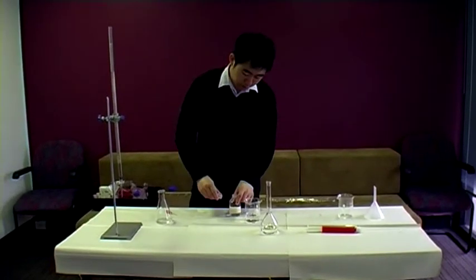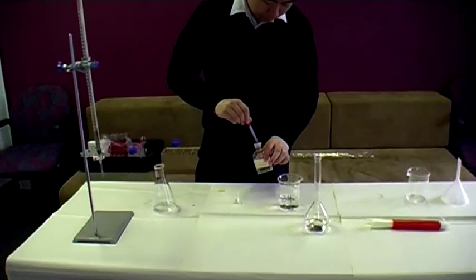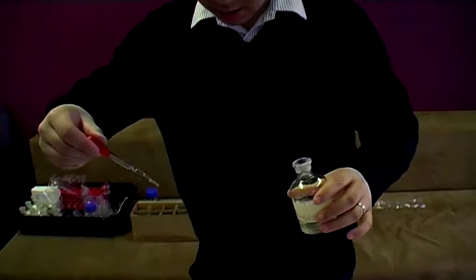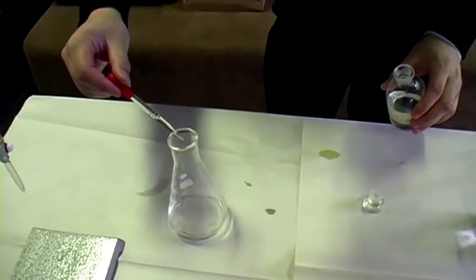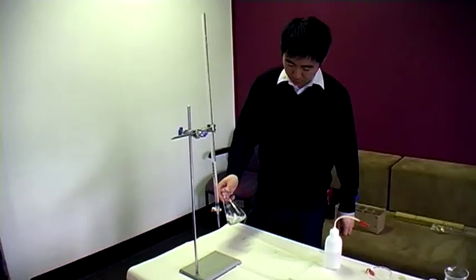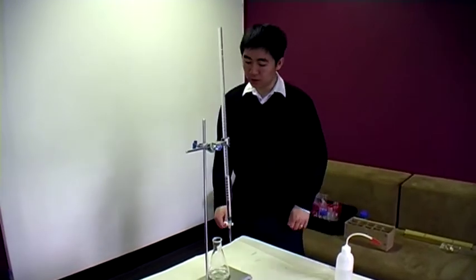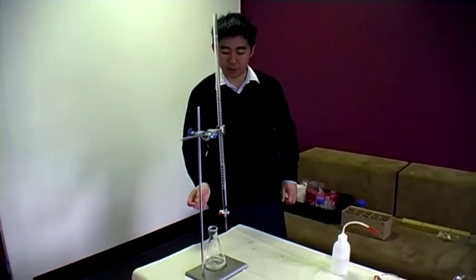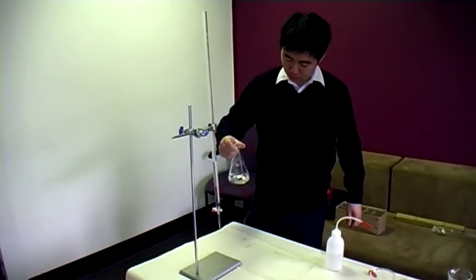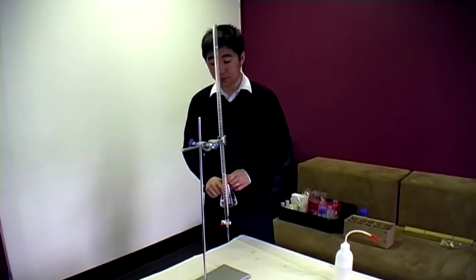We add two or three drops of phenolphthalein because our conjugate salt at the equivalence point is slightly basic, so we choose this indicator because it's appropriate. One, two, three drops — that's quite enough. We see here that exactly 23.1 mLs of the standard was enough to make this completely clear, turning with just one drop — exactly the same as our rough titer.